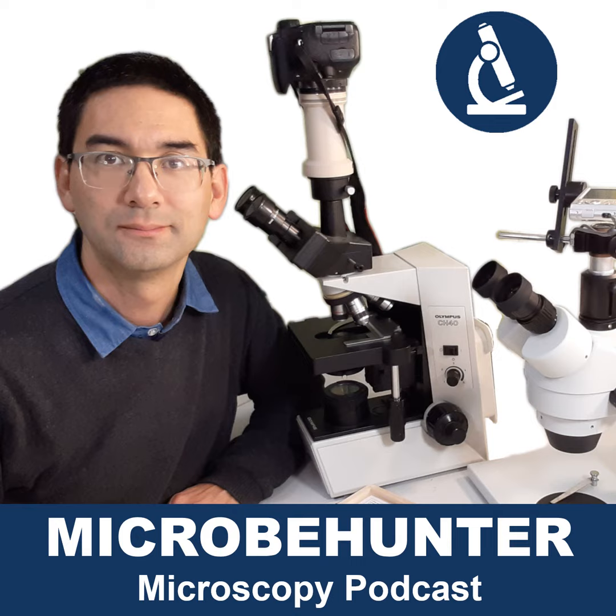The objective projects an image into the tube of the microscope, which is then further magnified. So 160mm refers to the point inside the microscope's tube where this image is made, and this image is then further magnified by the eyepiece.